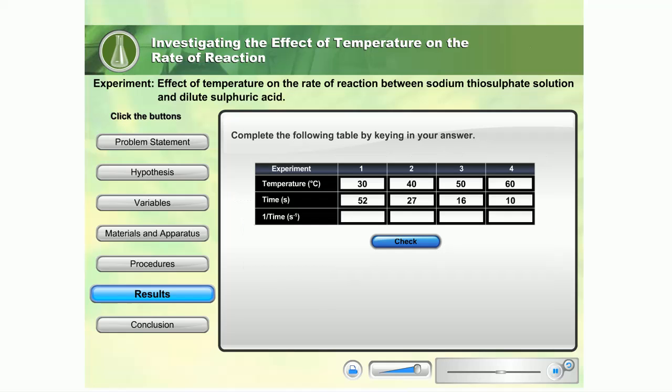Based on the results of the experiment, calculate the average reaction rate at different temperatures. Key in your answers into the fourth row of the table, then click on the check button. Well done!